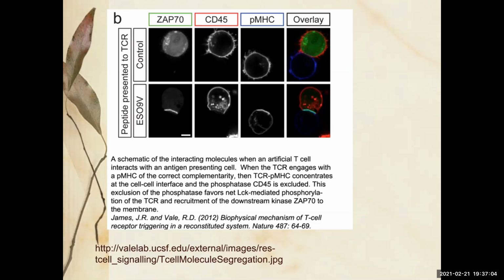And then they're messing with these cells. They've got this system to look at these two cells and how they interact. When they change something genetic in the cell, they see that this protein appears right where the two cells interact, whereas it doesn't here. So this is the info contained in this image: in this case, there's just the two cells touching each other. In this case, the two cells touch each other, and there's also this protein right there where they touch each other, nowhere else.